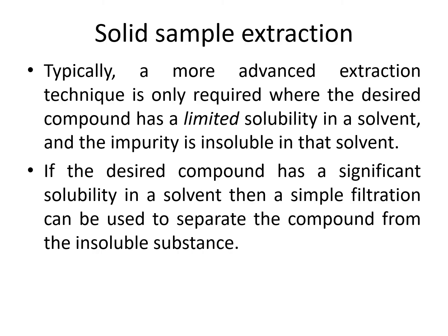So now class, basically, a more advanced extraction technique is only required where the desired compound has limited solubility in a solvent and the impurity is insoluble in that solvent. If the desired compound has a significant solubility in a solvent, then a simple filtration can be used to separate the compound from the insoluble substance.